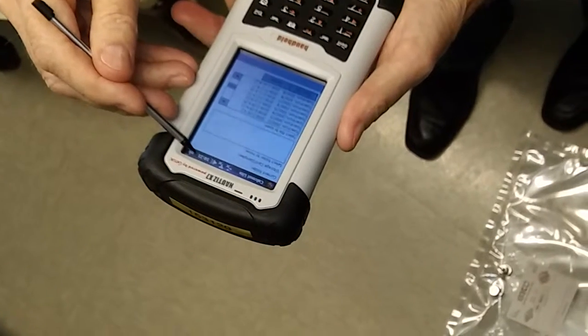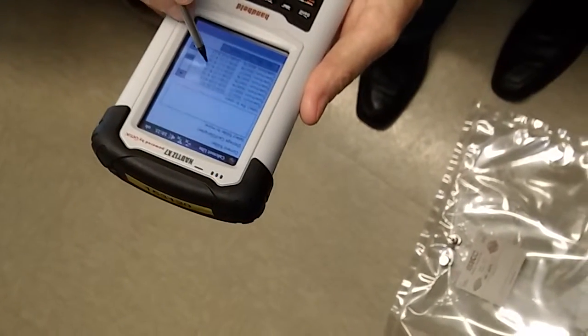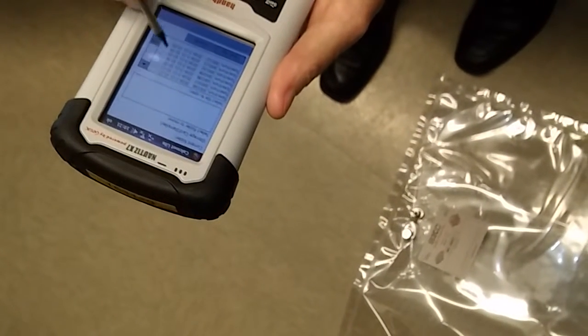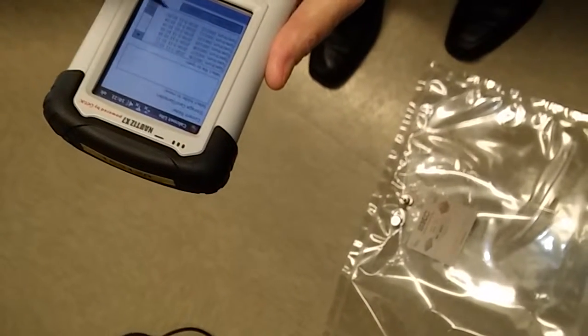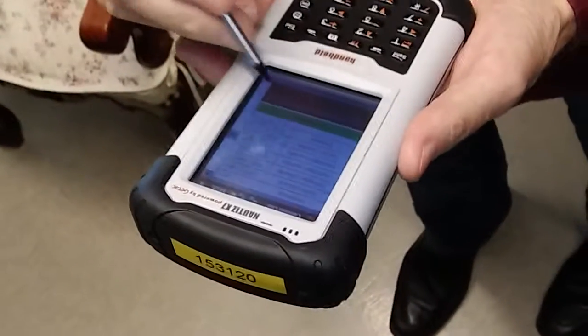See, it shows the time up here at 10:21. So earlier in the day, I was playing with it at 8:15, 8:16, 8:17. So these are the various times. At 10:20 we were playing with it, and it shows the results at 10:20. So you can go back and look at it, and see what file you saved. But again, it'd be nice to be able to take this and put it into the computer, but I can't do that right now.